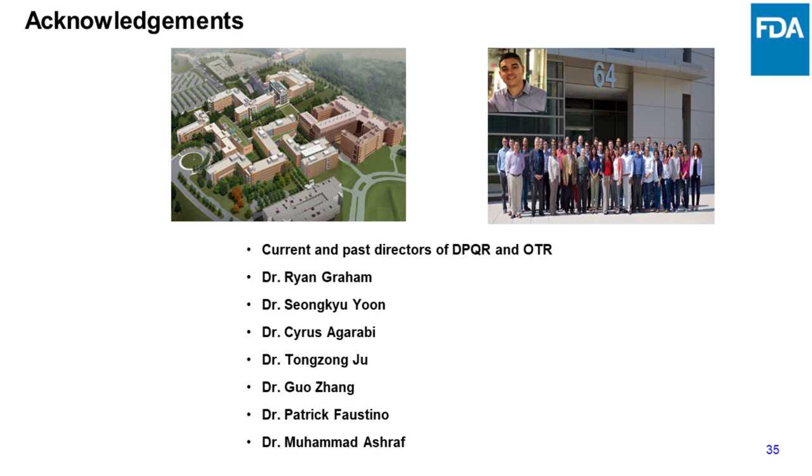So the first question is: from the metal concentration determination perspective, did you have to develop different methods for different cell culture medium, or just vary the dilution factor in the procedure?